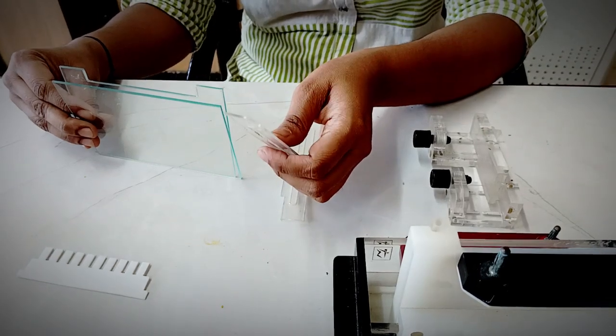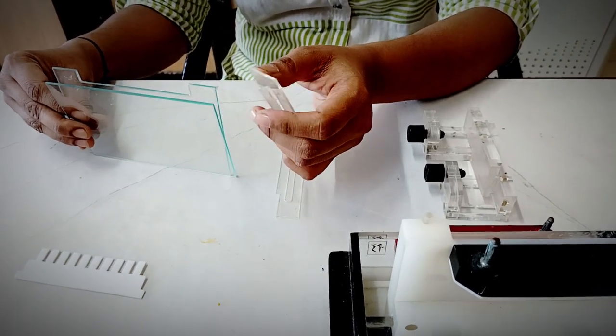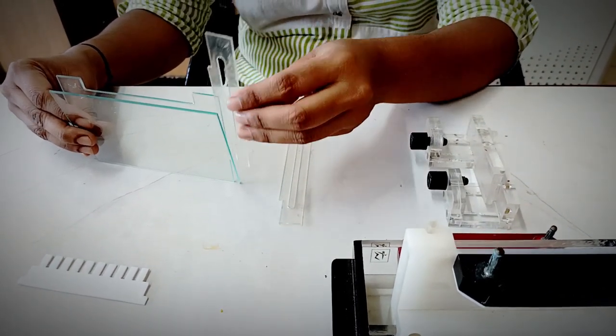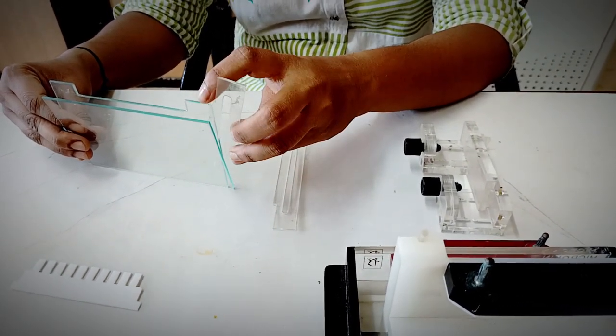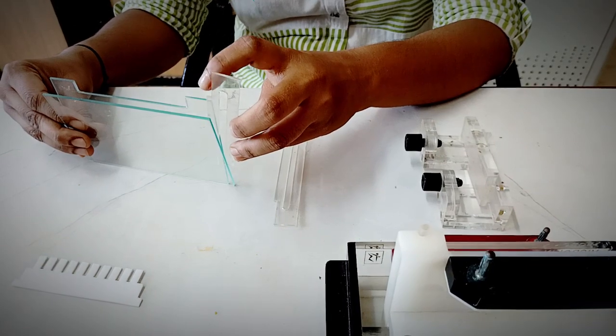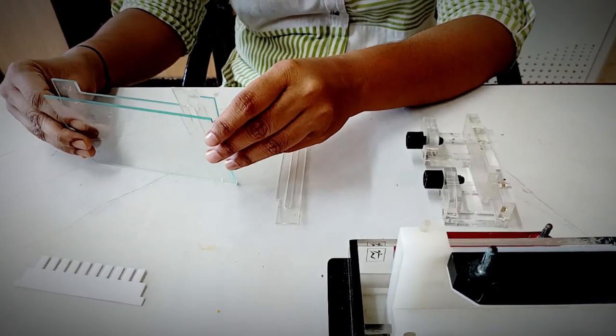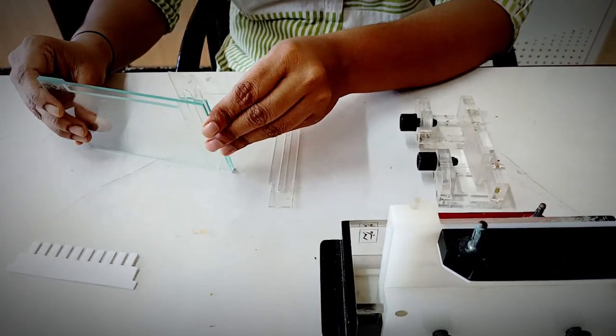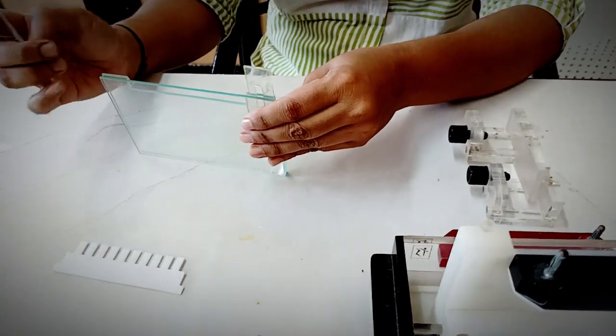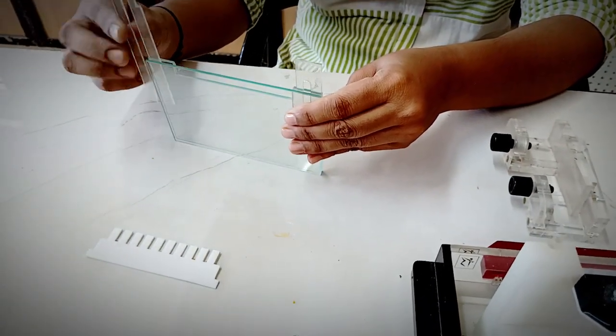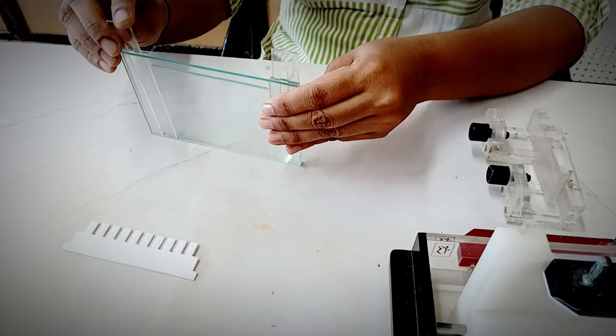The spacer has one plain side and one side with a notch. You have to keep the spacer in such a manner that the side which has the notch should be facing inwards, and the side which is plain should be facing outwards. Similarly, you have to place another spacer also in this manner.